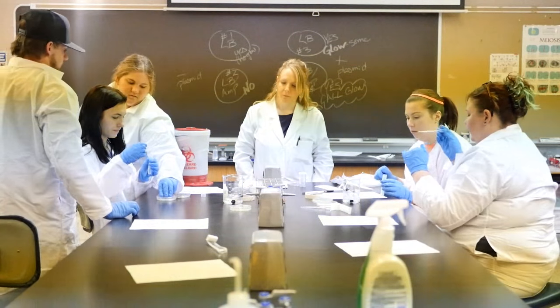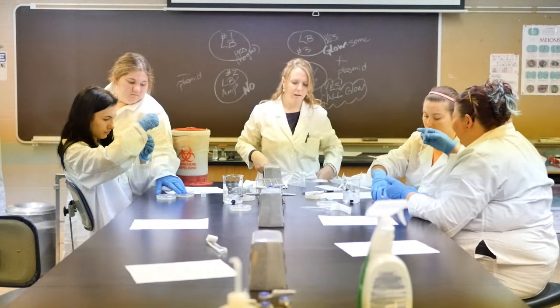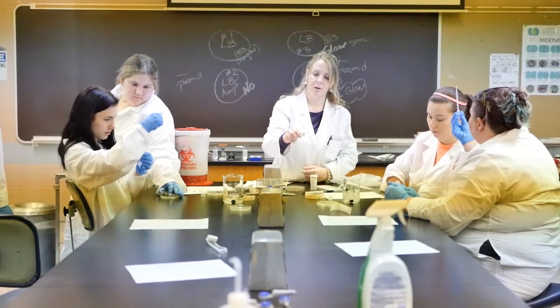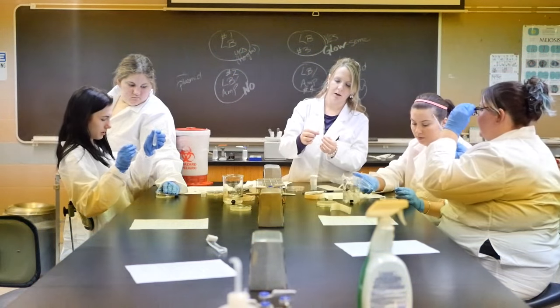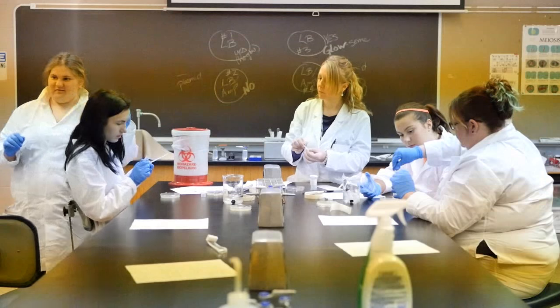I'm not looking for numbers printed on there. They've got numbers printed, I think, at the 0.5. Yeah, at 0.5, but they've got the score, they don't have the 100. I was looking for numbers. So the 100 would be here. Okay, your turn.